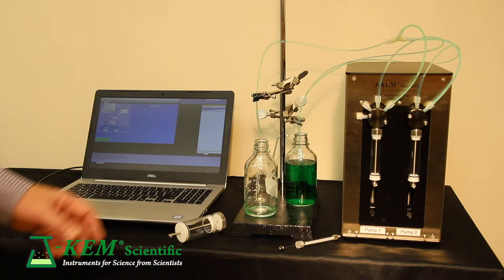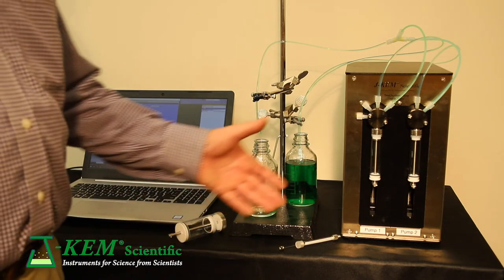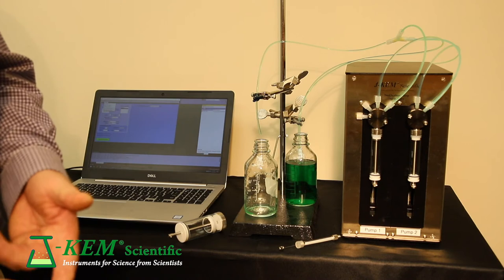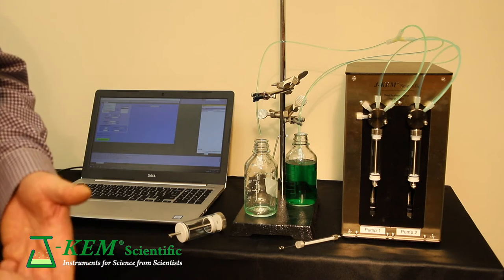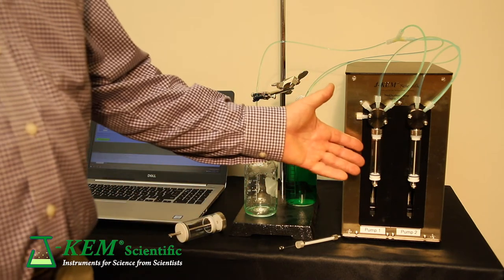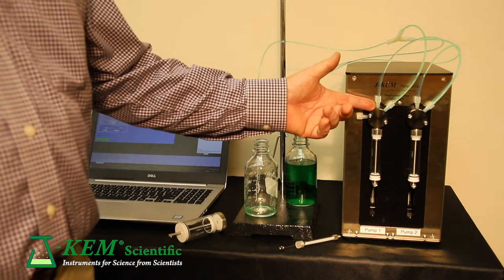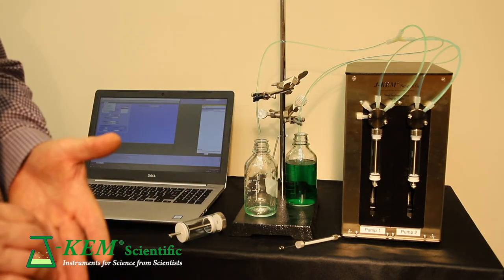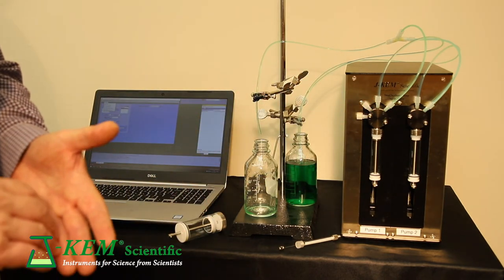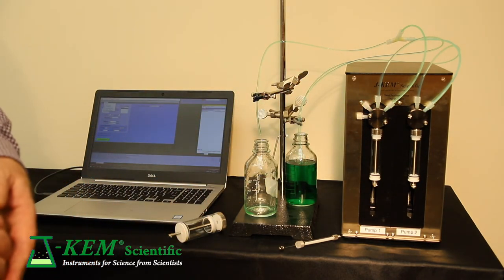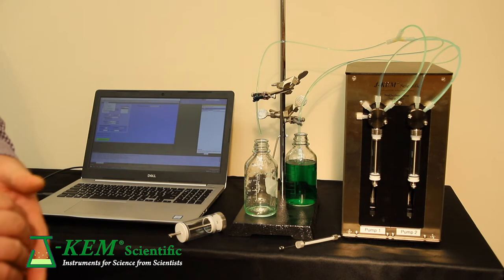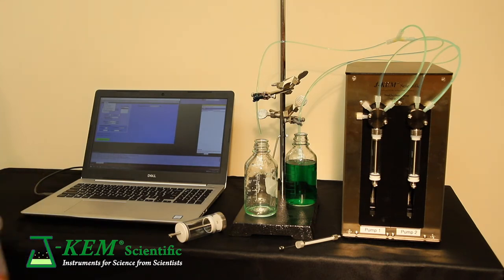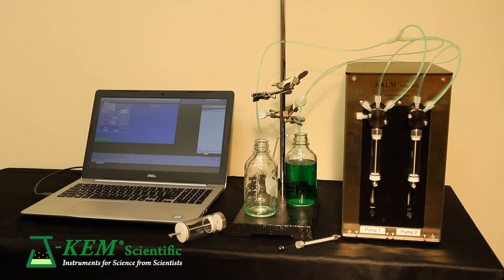Regarding the pump itself, it has a 100% inert flow path. It's either a glass syringe and it's a teflon valve. So you can dispense any aqueous solution or organics or strong acids. We even have customers who dispense concentrated sulfuric acid from this.